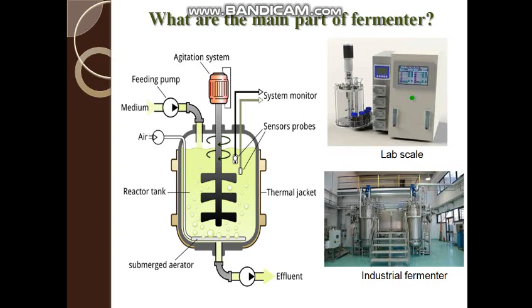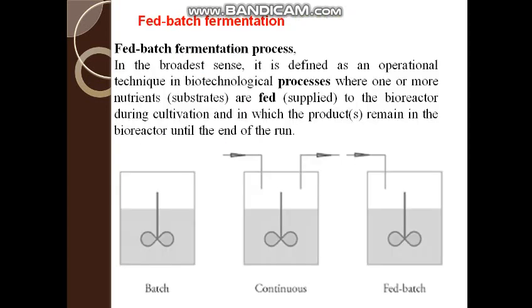Already we had discussed bioreactor, types of bioreactor, and the ideal parameters required for designing of bioreactor, then how a lab scale fermenter looks like, as well as an industrial fermenter. Now we'll see in detail about fed batch fermentation process.